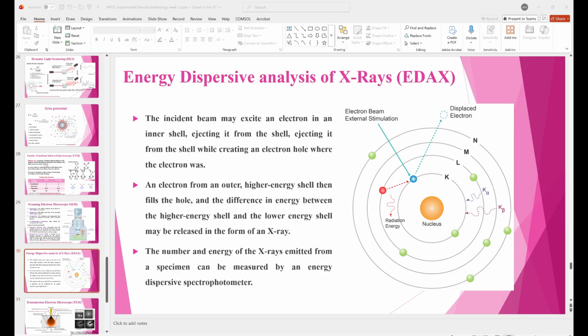And here is shown a sample reaction volume with the electron beam, which is very important for different techniques. So when your electron beam comes and hits your sample, you can see that secondary electrons are basically near the surface of the sample. So they give you a topographical image, that is a surface image. Then lower than the secondary electron is the backscattered electron, which gives you the phase difference. Then lower than that is the characteristic X-ray, that gives you thickness and atomic composition.